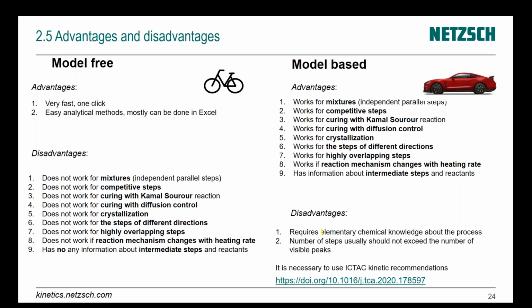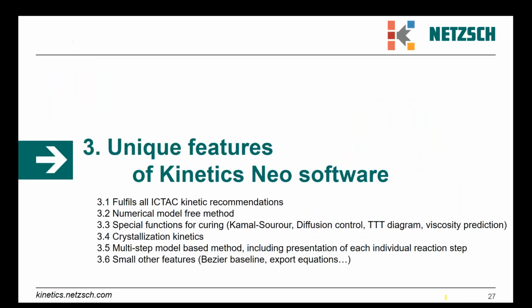elementary chemical knowledge about the process. That's the first, and the second, you need to know the rules, how to apply this method. And the rules are in the ICTAC kinetic recommendations. You can find them here, or you can find a link on our Kinetics website.